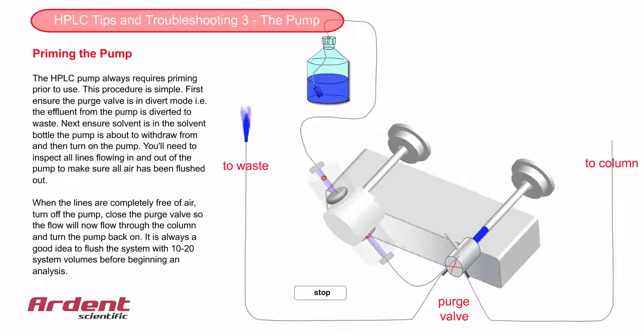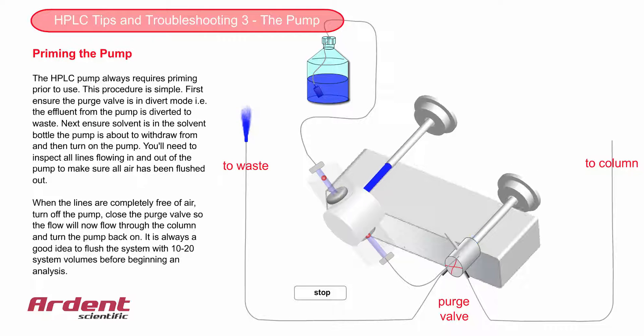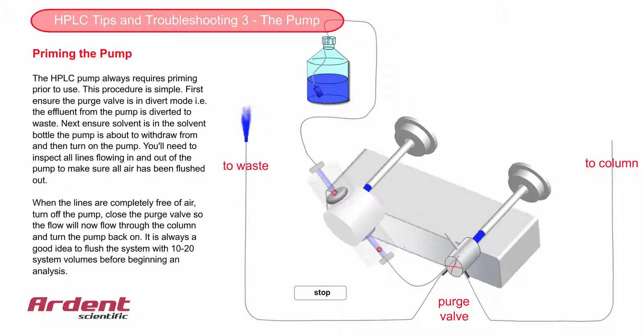Turn the pump on, and then as the solvent flows through the plastic lines into the pump, look for air bubbles. Keep the pump on and in purge mode until all the air has been flushed from the system. This could take up to several minutes.